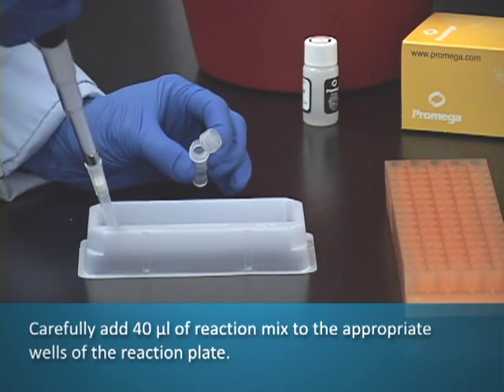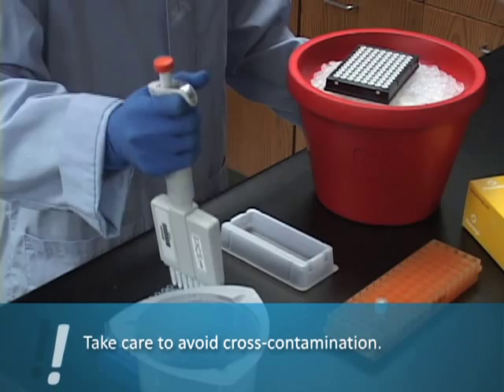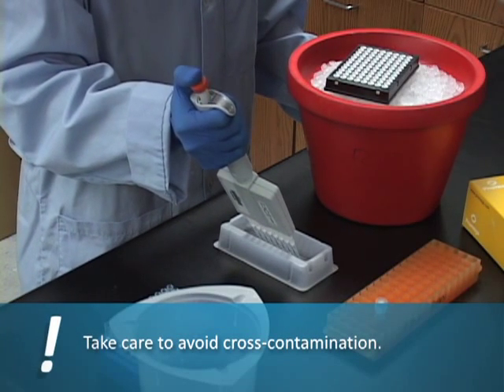Carefully add 40 microliters of reaction mix to the appropriate wells of the reaction plate. Take care to avoid cross-contamination.